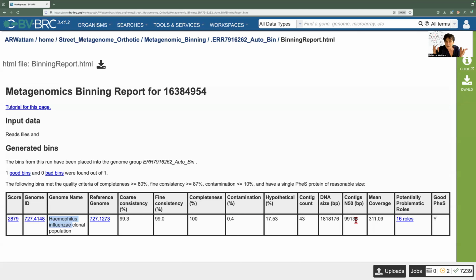So it's just a measure of how good it is. If you have a lot of really, really, really small contigs, it's an indication that something is wrong. Coverage. We've talked about this before. Coverage indicates how many reads are mapped to these individual contigs. And if there's no coverage information, it'll just say 50 for some reason for every bin.